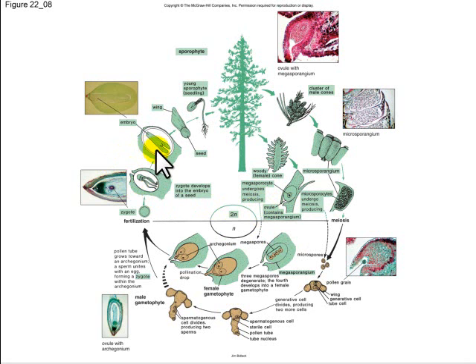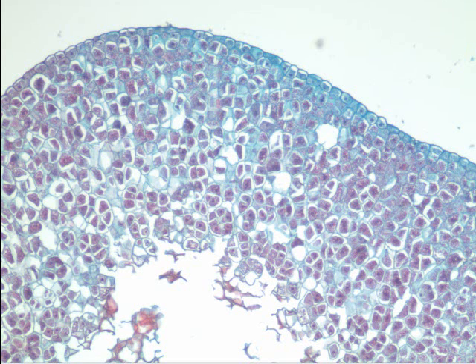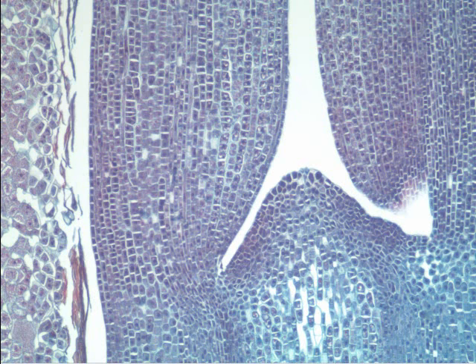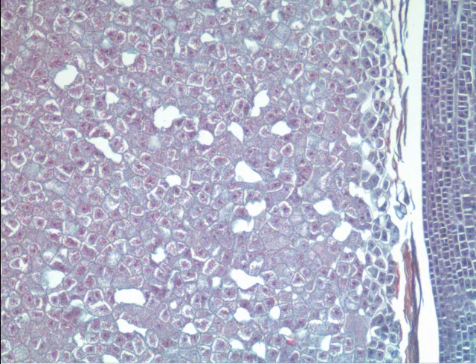They didn't keep their color coding going very well here because we got something in here and something out here. It doesn't show that too well, but a three-part seed that could have developed, if all goes well, into the mature sporophyte. But let's look at a seed. This is the top center. Here we're coming down. Ooh, what do you suppose we're looking at here? Oh, that must be the what? The embryo. Well, in a pine seed, what's immediately outside the embryo? The what? The female gametophyte. There's embryo to the right, female gametophyte to the left.